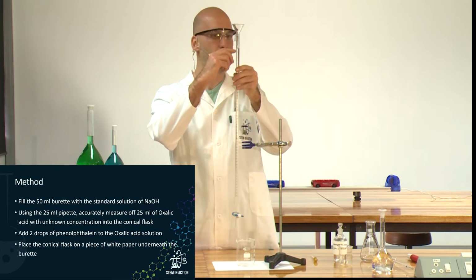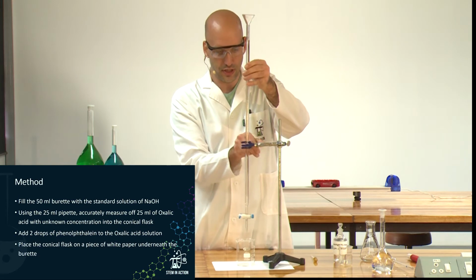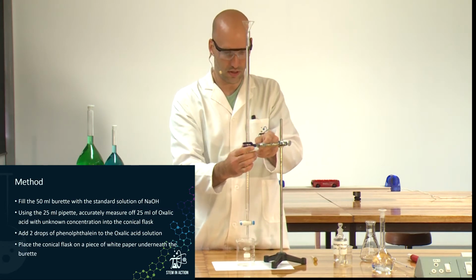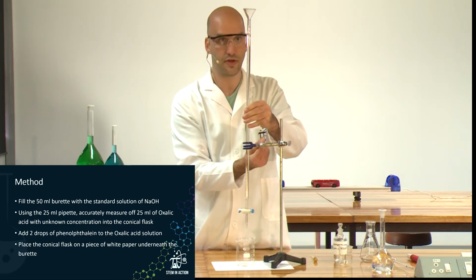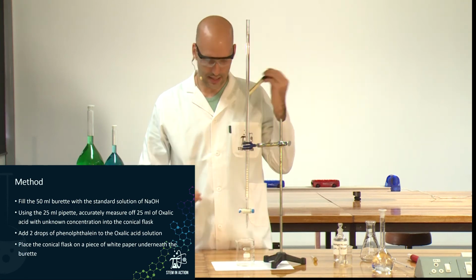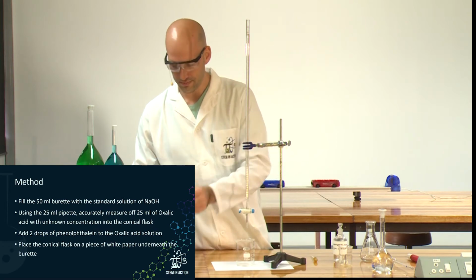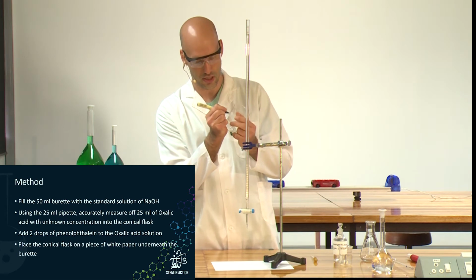Okay, I'll overfill it a little bit, but you'll see just why I've overfilled. I'm just going to put it quickly back into its clamp. Just move this up a little bit and make sure everything is nice and tight. I'm going to take this out, move it to the side, and something that we just need to do is remember to label my equipment. So this is NaOH. I'm going to just leave it on the side, and this is going to be the waste beaker.